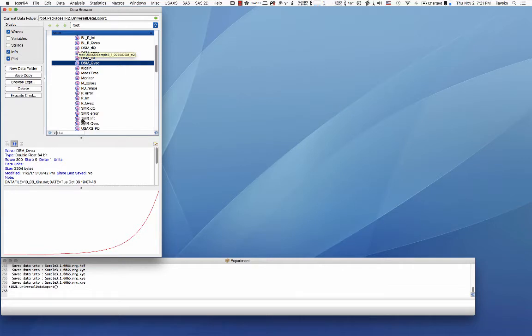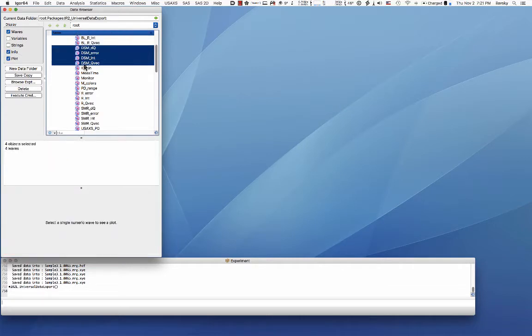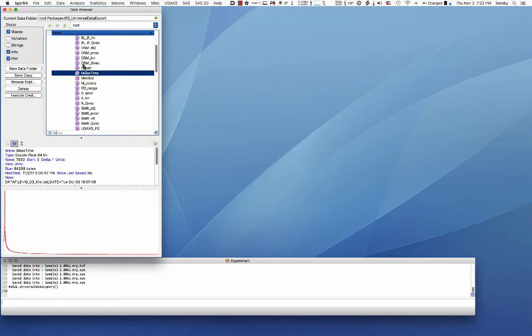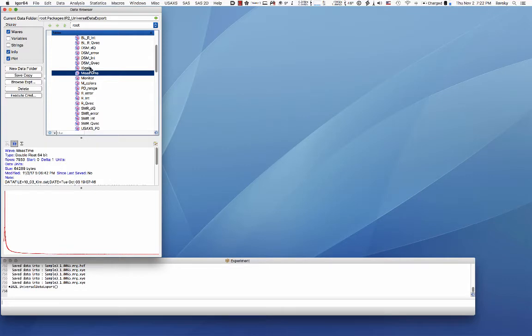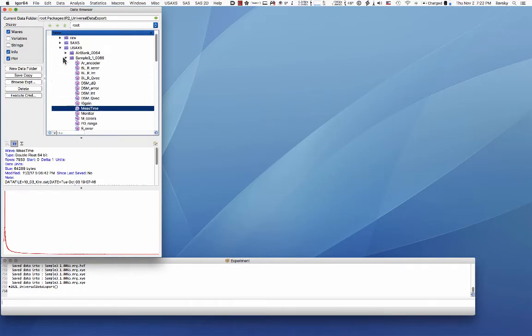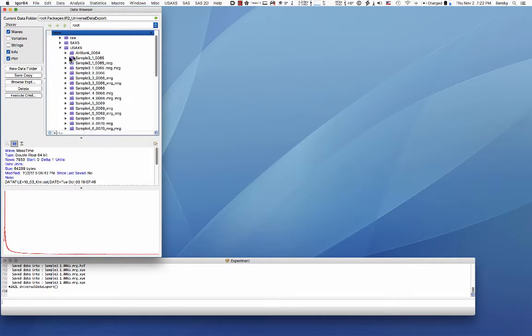You can take the slit smeared data and generate these de-smeared data. It's a DSM_Q vector, de-smeared Q vector intensity uncertainty error. These are the numbers or data which you can model in anything. All of the rules and conditions are valid for these. Now that's a USAXS segment.